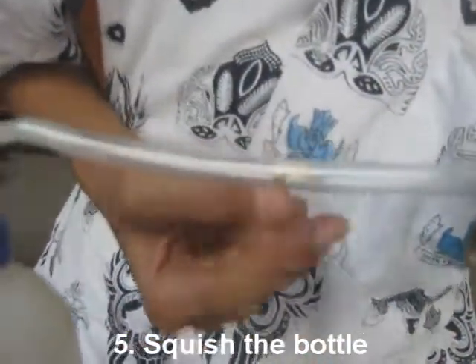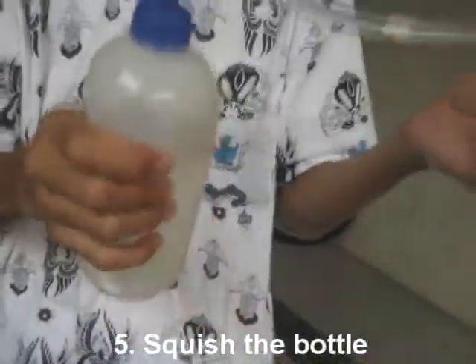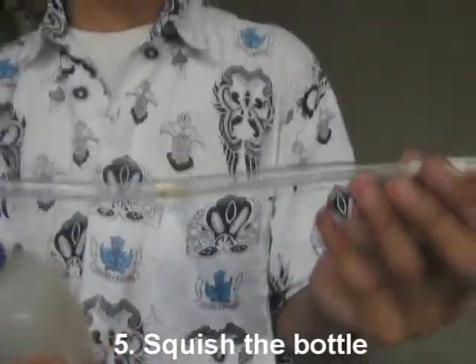That color is brown — brown or yellow. Repeat it. The nicotine is collected.